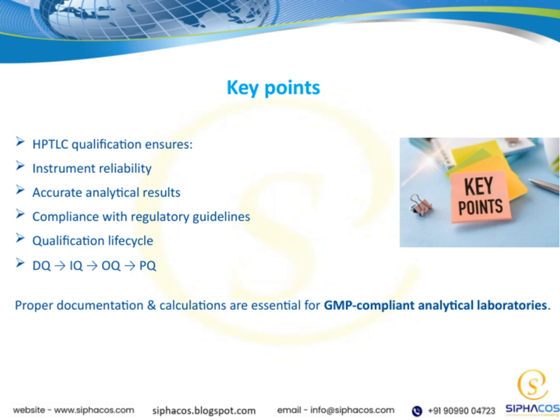entire process. They're what make our laboratory GMP compliant, ensuring traceability, accountability, and quality in everything we do. So, thorough documentation isn't just a formality, it's a core part of maintaining integrity and confidence in our analytical work.